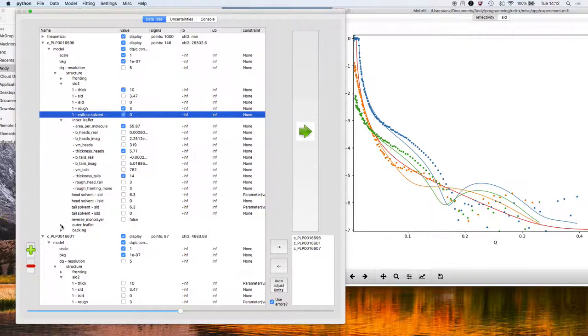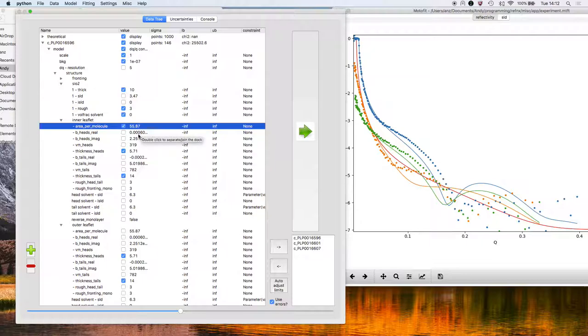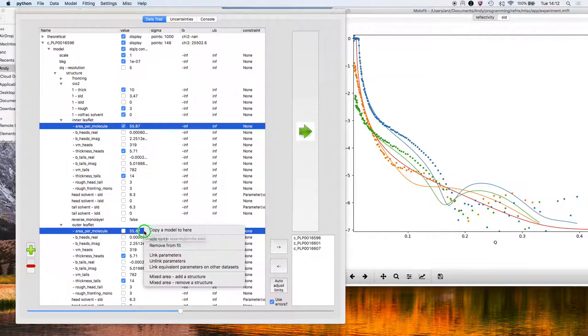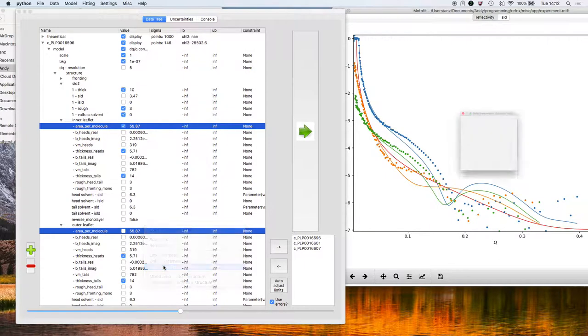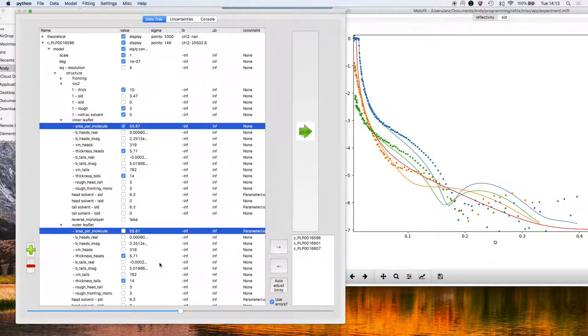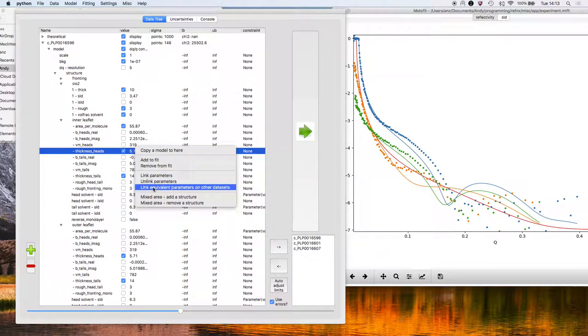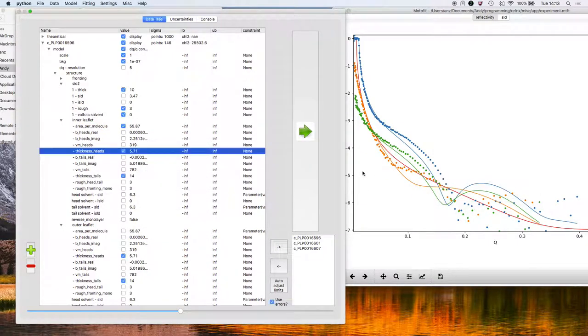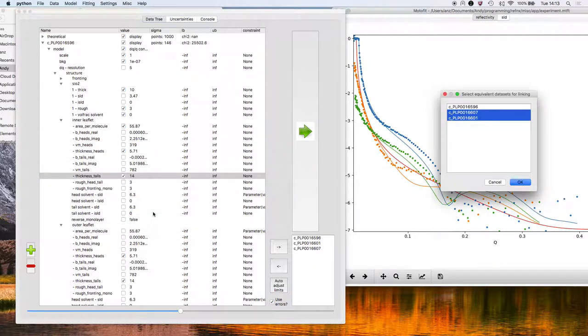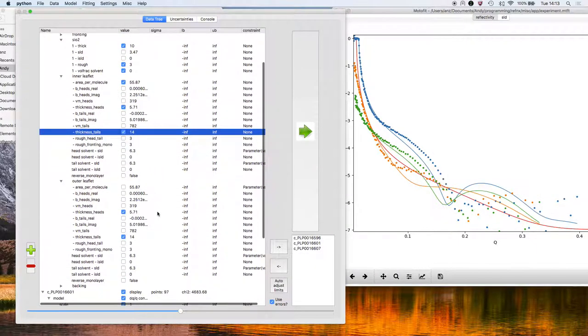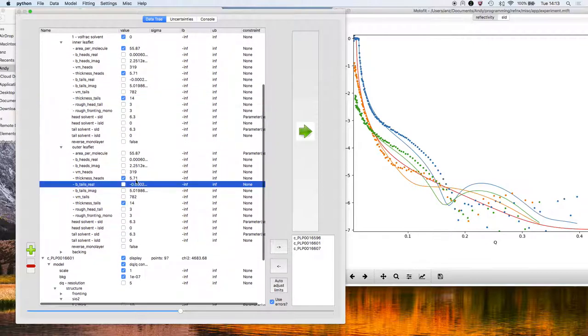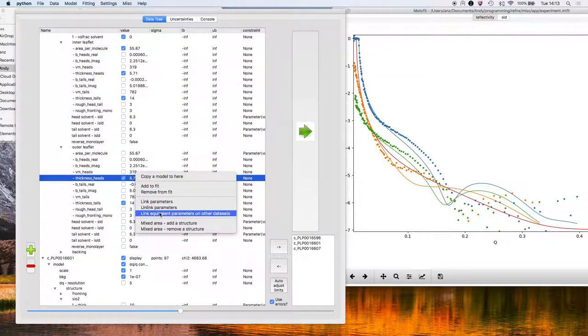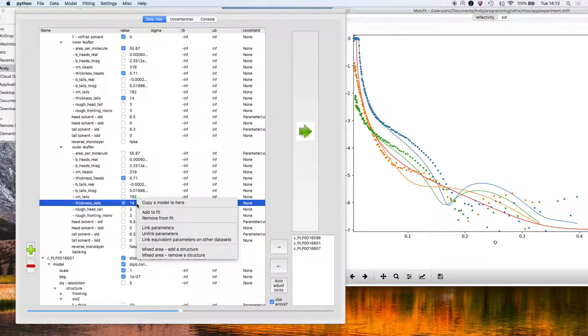Now, with regards to the area per molecule, I want to set that the same for inner and outer leaflets for all the contrasts. So I'm going to select both area per molecules for the inner and outer leaflet for the first contrast. Right click, link equivalent parameters on other datasets, and do the same for the head thickness, the tail thickness, and for the outer leaflet parameters as well.